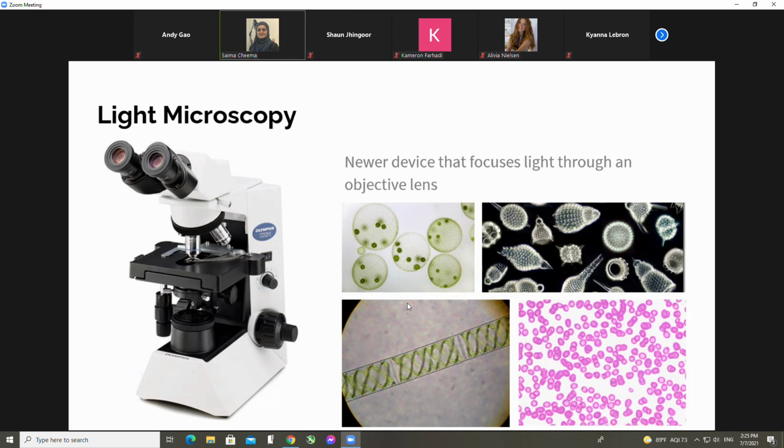Okay, so generally, the microscope that we use uses white light, right, which has a range of wavelengths. So if you wanted to calculate the resolution, then you would have to calculate it for individual wavelengths. So you could have the blue light wavelength, which is going to be a lot shorter than, say, the red light wavelength, right? So you would have to do monochromatic light. So the light source should just give either blue light or red light or orange light or green light, whatever lambda you choose, which is wavelength.